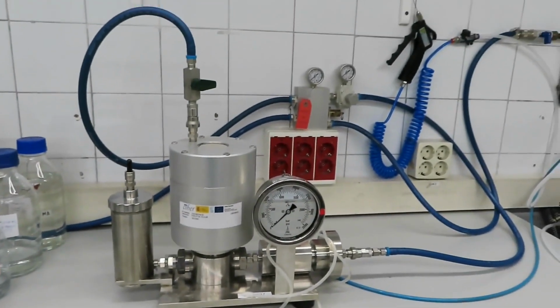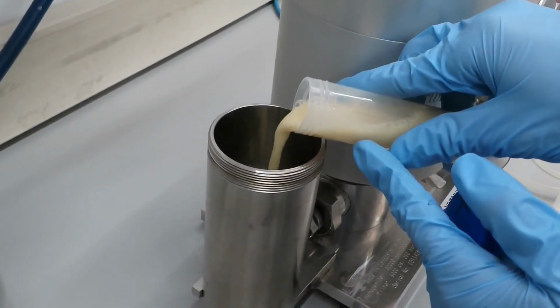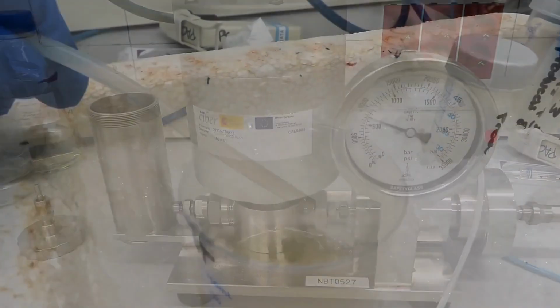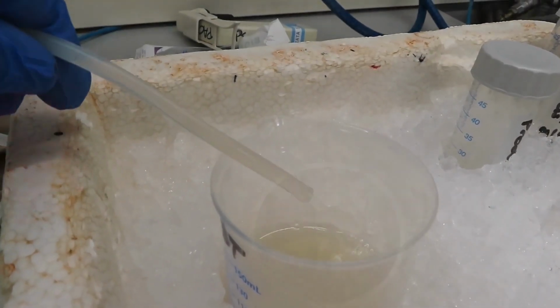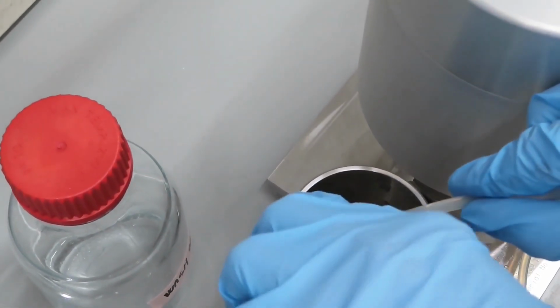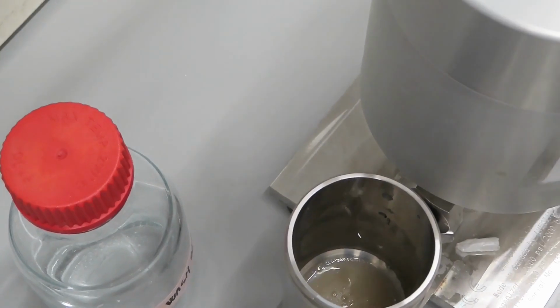In this case, we use a disruptor as a cell lysis method. This is a homogenizer that passes the cells at high pressure through a valve, disrupting cell membranes. The sample is passed several times to be sure that a high percentage of cells are disrupted.